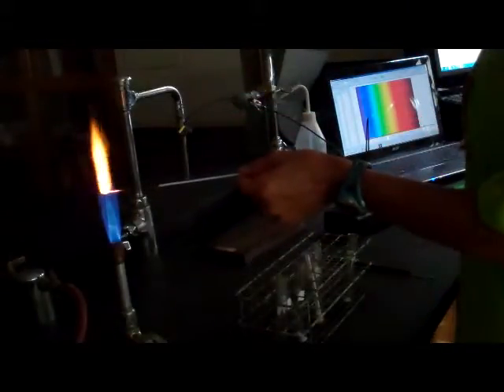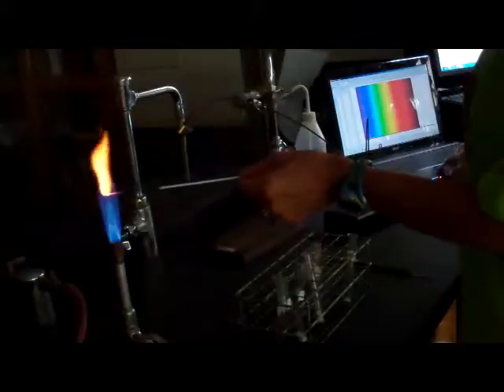Next solid is calcium. A little harder in the dark. Get that sample. Hitting collect on the computer.